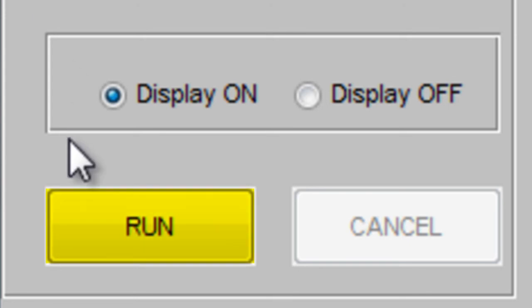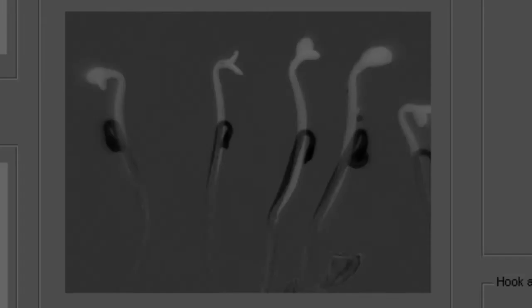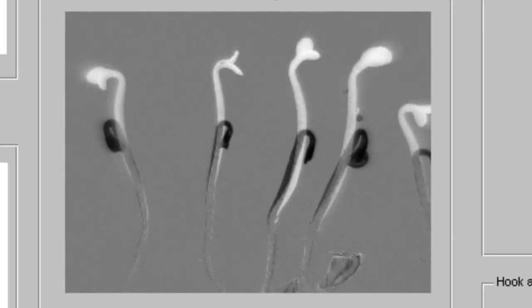After you have made all of your parameter selections within Hypotrace, click Run. Hypotrace prompts you to make an area selection for your seedling of interest. Click and drag to create a box around your seedling.